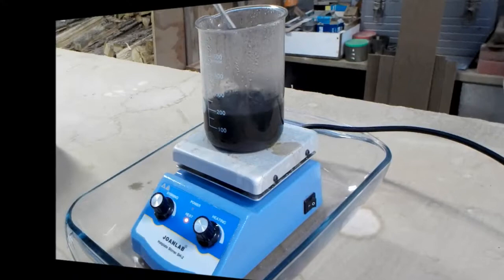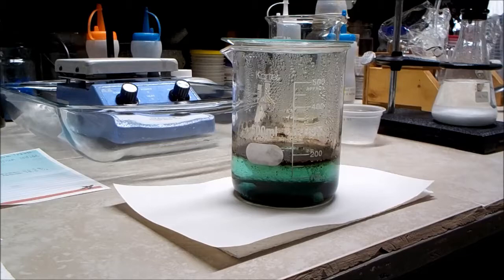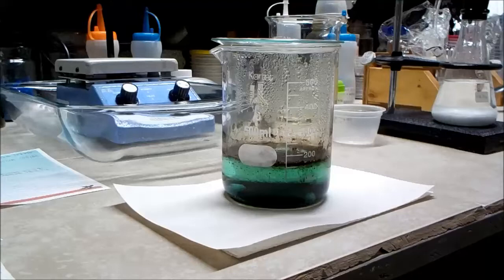So now the reaction has finished, and I've brought it in from the greenhouse back down to the lab, and it's been allowed to sit overnight. As you can see, it has a lot of dark carbon in it, so I'll be filtering that out. Fortunately, I don't see any crystals in there, which means that I did add enough water, so that's good. Otherwise, I would have had to add water and redissolve the crystals before I filter it. So I'll go ahead and do the filtering now.